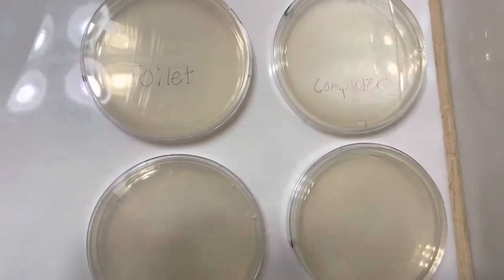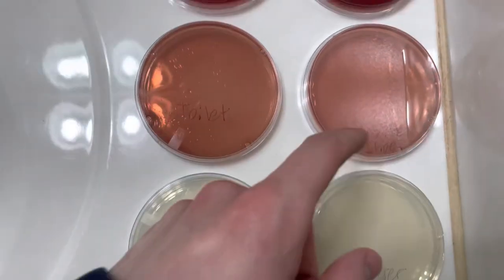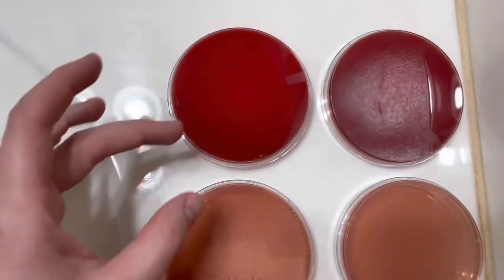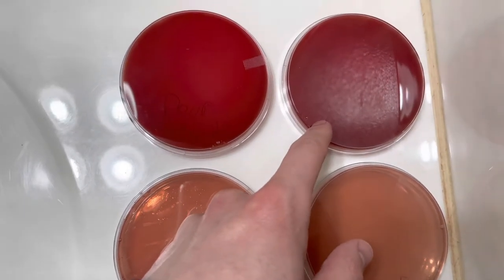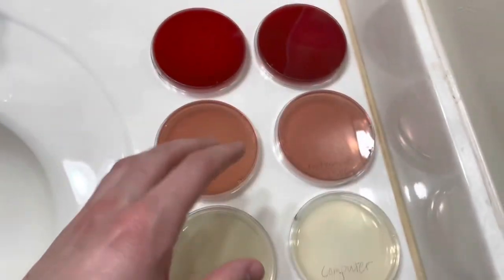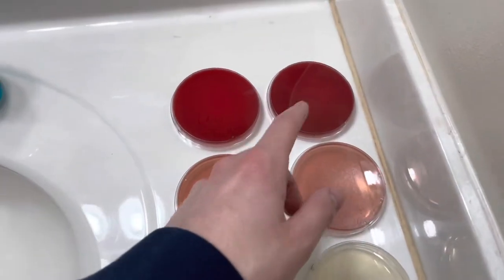So the whole process is complete. I got the game controller, the cell phone, the toilet, the computer, toilet on a different plate, bottom of a shoe, a door handle, and then I did a control, which is just filtered water from our Brita filter. Hopefully that doesn't grow anything — if it does, this whole experiment is pretty much out the window, because that shouldn't grow much, if anything at all.